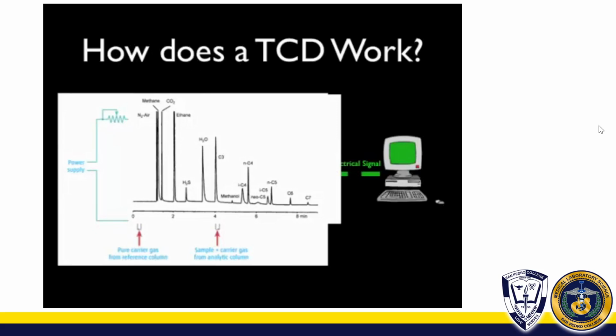Okay, so just to explain further, let me give additional input or more emphasis on how your TCD works. You mentioned earlier the Wheatstone bridge, right? Now, what is this Wheatstone bridge?